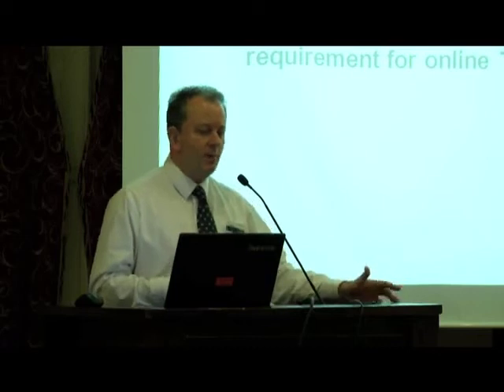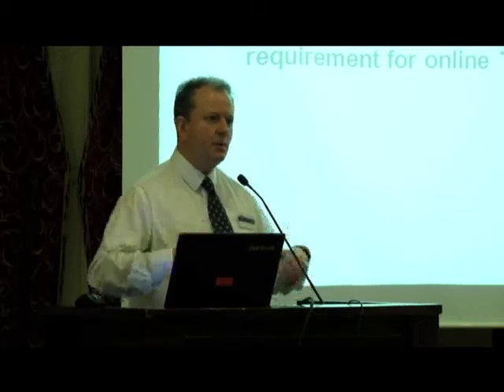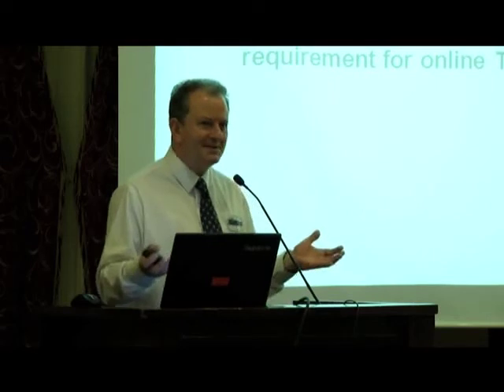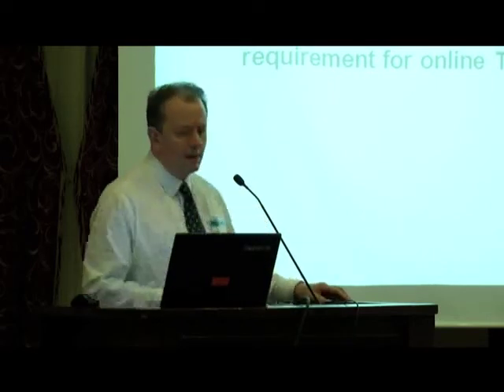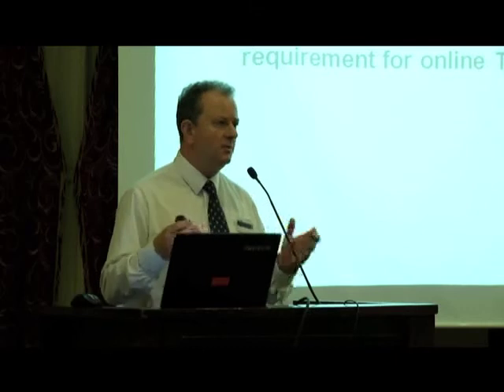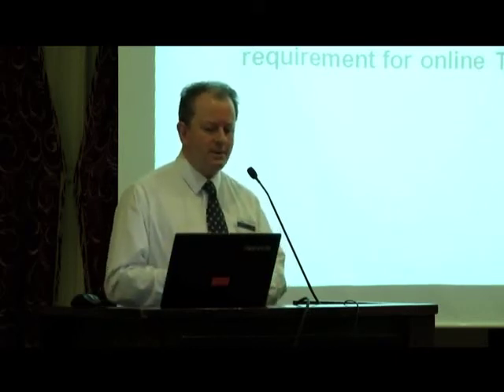Until recently, all of the pharmacopoeias stated that we should oxidize all of the organic material completely, which is obvious because how can you measure it if you don't oxidize it? So the United States Pharmacopoeia said that we should share the objective of completely oxidizing the organic molecules. The European Pharmacopoeia says the same thing, we should completely oxidize it.